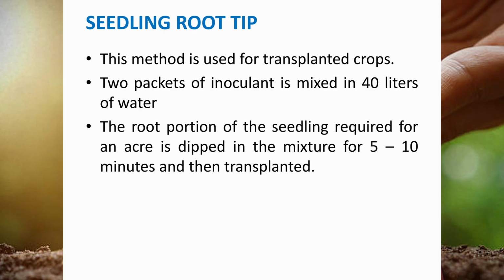First one, seed treatment. Take a sterile plastic bag and add 2 kg of carrier material. Take 2 kg of seeds, and to the plastic bag we have to add 10% sugar solution, which is the sticking agent, and inoculate the seeds in the bag. Then the seeds are dried under sterile condition. After that we have to apply them on the field.